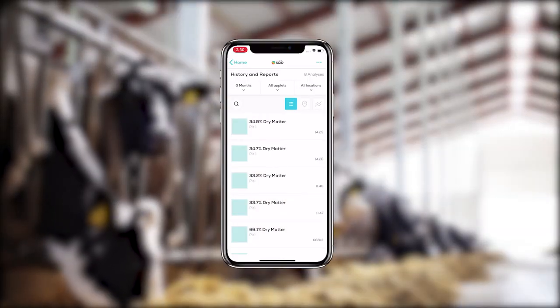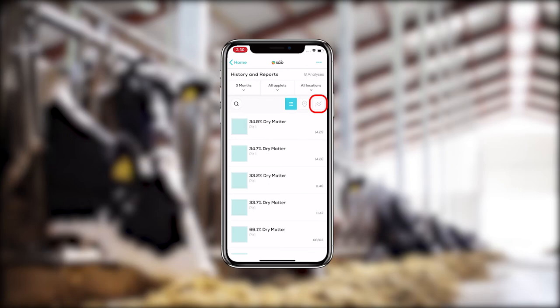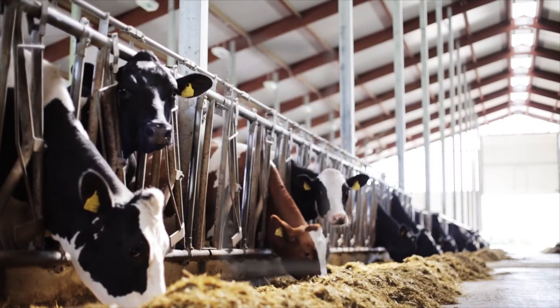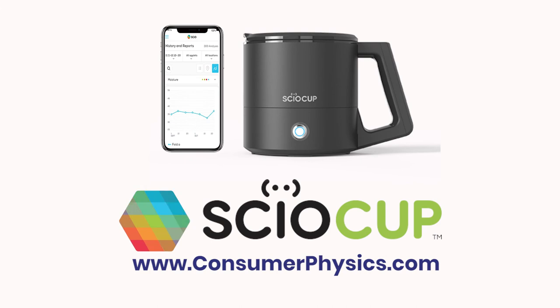You can always go back and track results across time and location by clicking on the Trends button in the History and Reports screen. Siocup by Consumer Physics.